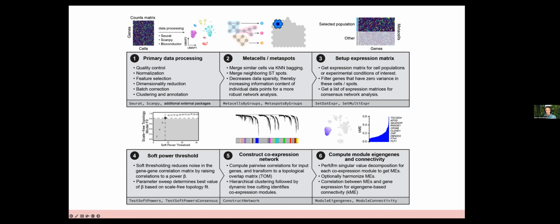to account for these very single cell specific things. And the other thing we do is compute the eigengene based connectivity, or KME, which is very simply just the correlation of the gene to the module eigengene. And that gives us a proxy for how connected the gene is in the network. So that'll allow us to identify the most connected genes, which we refer to as hub genes. Okay, so this is just the basic workflow.